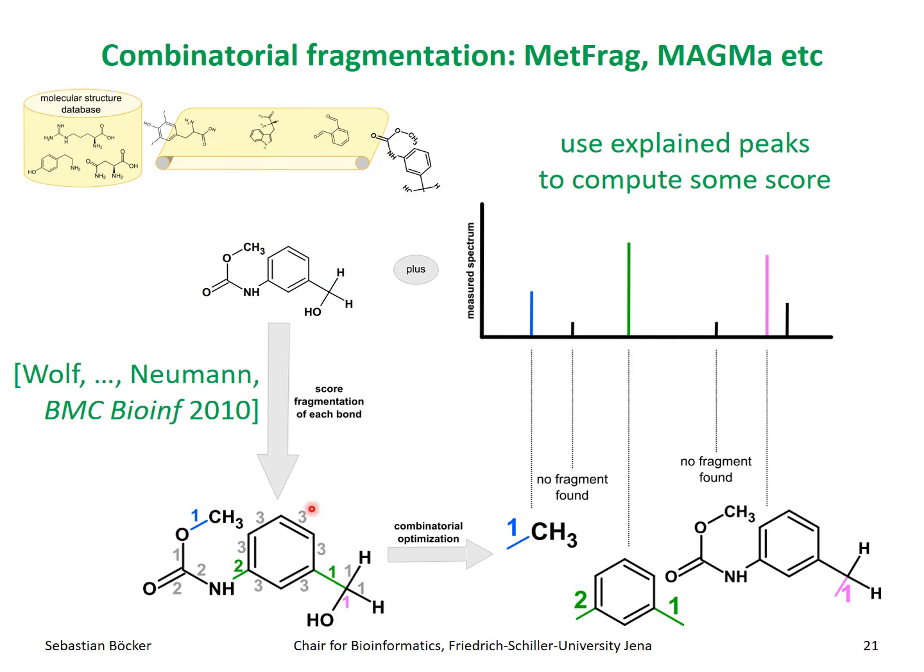And what we do is we don't simulate really in silico fragmentation. Instead, we simply do a combinatorial breaking of this molecular graph. And then we see if we can explain peaks with these fragments that we generated from here. Even breaking a molecular graph is a nasty problem. So we have to make simplifications there. We have to use heuristics so it actually runs relatively fast. And still, the running times will be higher than for the other two approaches.